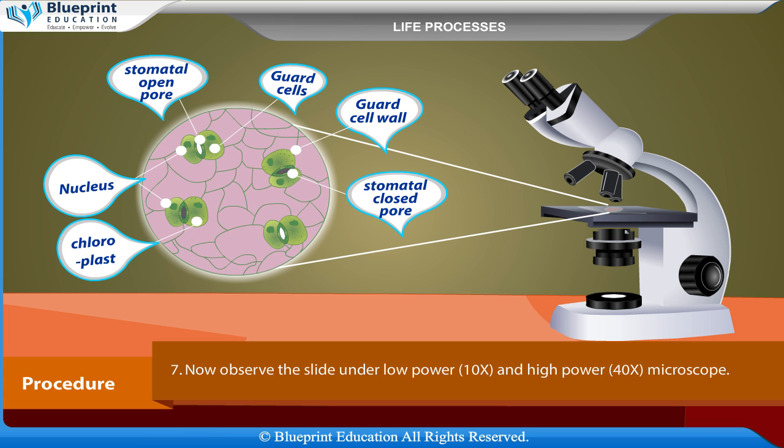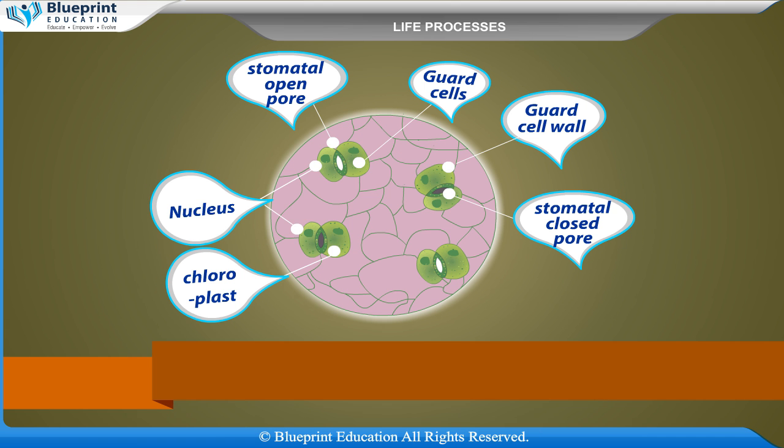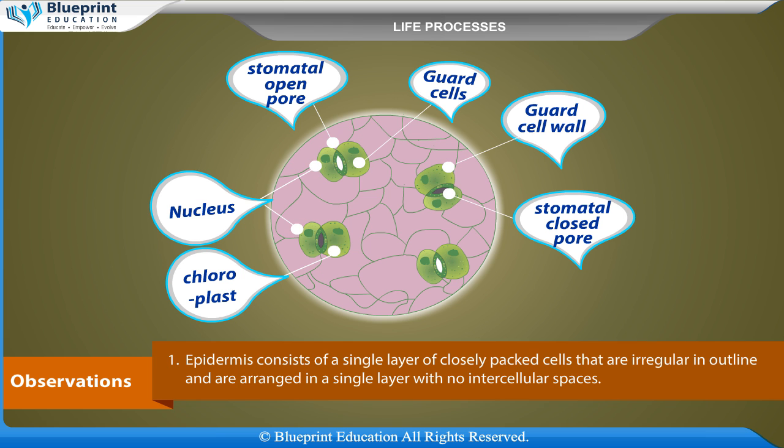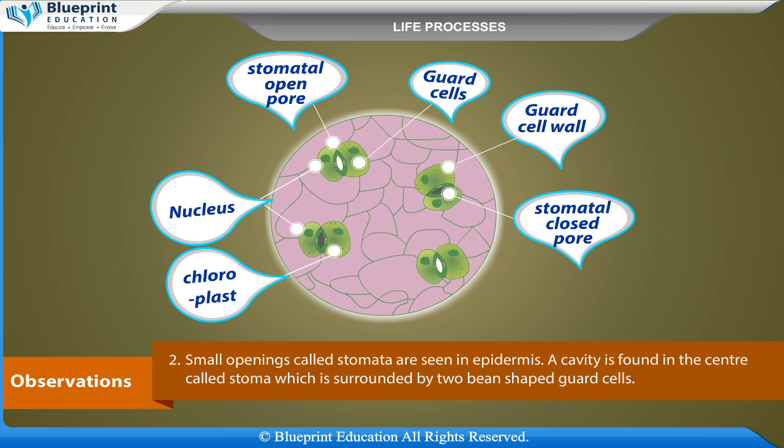Observations: The epidermis consists of a single layer of closely packed cells that are irregular in outline and are arranged in a single layer with no intercellular spaces. Small openings called stomata are seen in the epidermis.